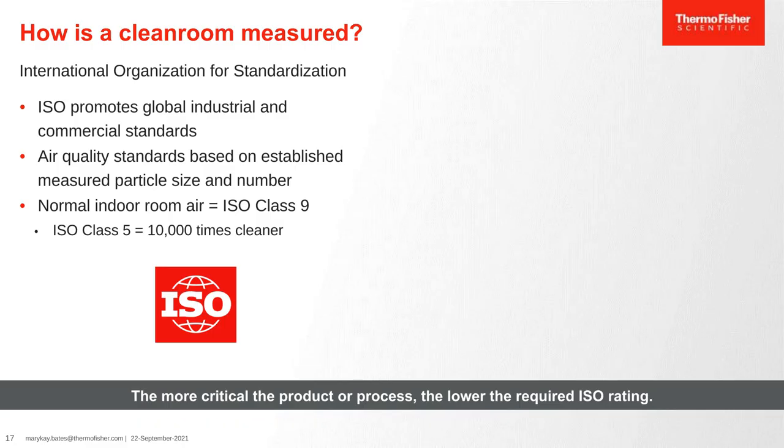But how is a clean room measured? How do we measure all of those particulates in a clean room? Well, this is determined by the International Organization for Standardization, or ISO. And ISO works to globally promote industrial and commercial standards. The air quality standards that ISO establishes are based on established measured particle sizes and numbers, and they define a particle as a minute physical entity, piece of matter, with defined boundaries.